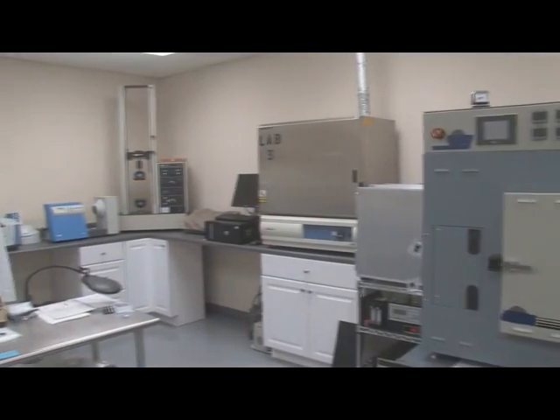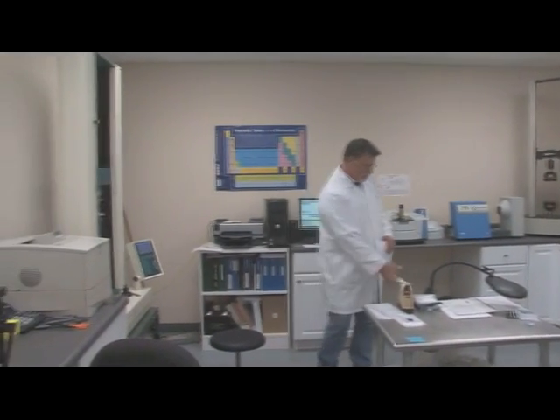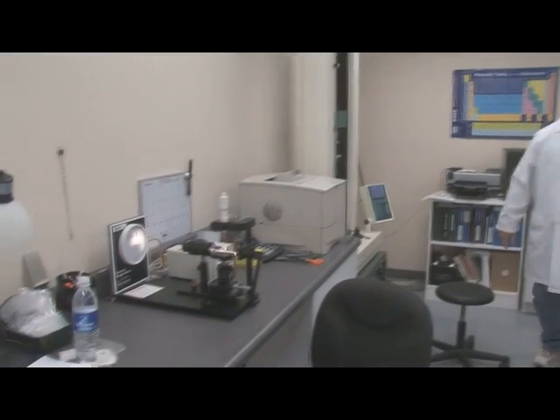So this is a very handy tool when it comes to identifying whether a material is or isn't meeting standards. Some of the other devices we have in the lab for both analytical work and also for development work are things like ovens, where we will take materials to certain temperatures and do evaluations on them. We have some small presses. We have a lot of scales to measure things like specific gravity and gram weights. Cupboards full of chemicals. Again, part of the work that we do here in the lab is new product development, and so there's a lot of things that we do here in terms of labware and combining materials.